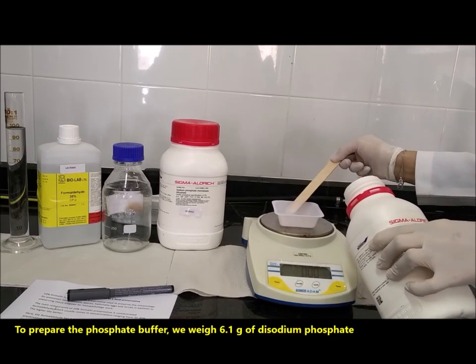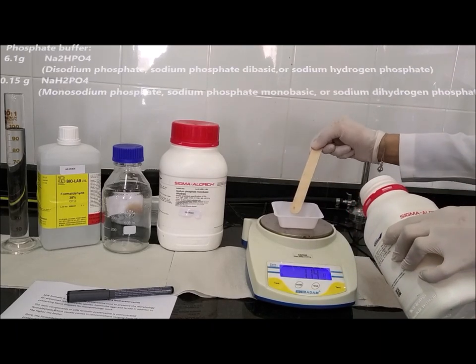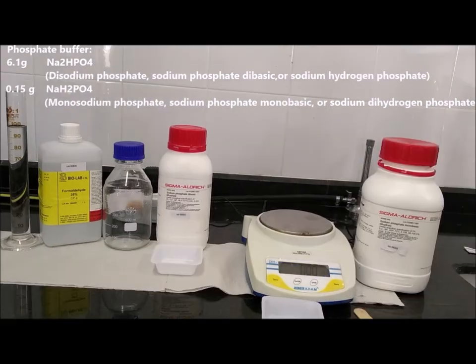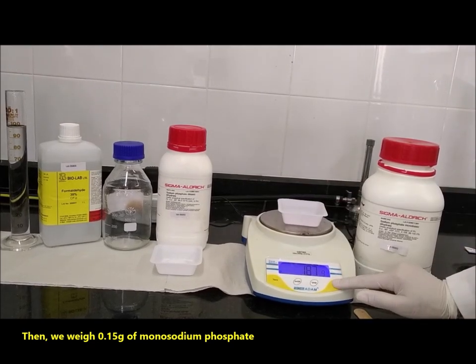To prepare the phosphate buffer, we weigh 6.1 g of disodium phosphate. Then, we weigh 0.15 g of monosodium phosphate.